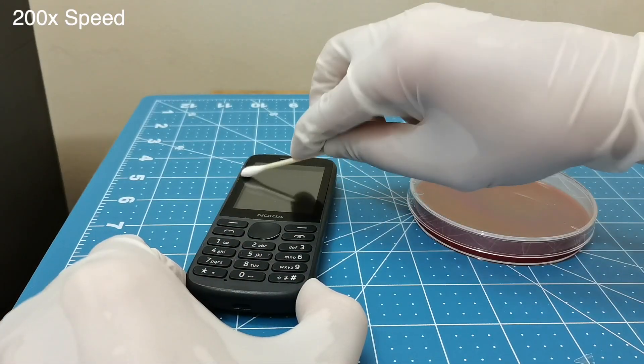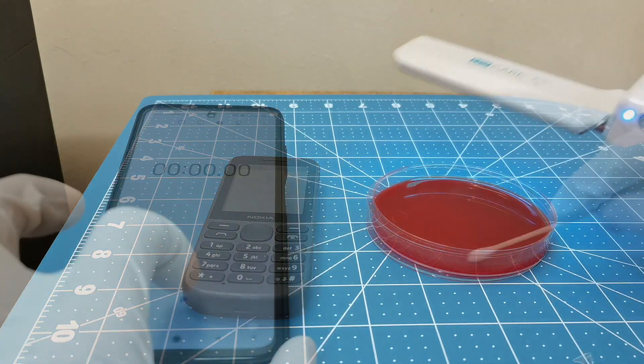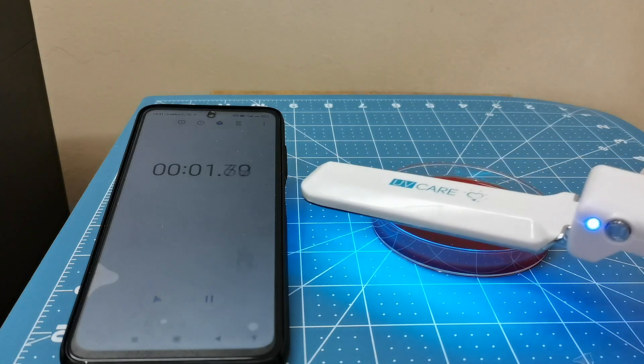We'll do the exact same thing with this petri dish — we'll swab the phone and then treat the petri dish with 60 seconds of genuine UVC.